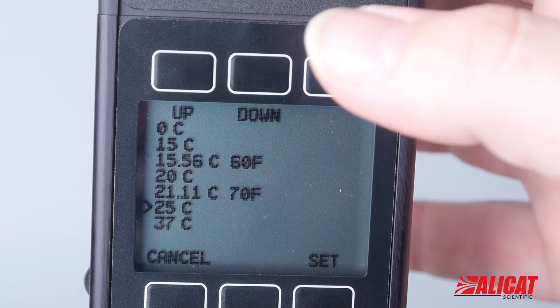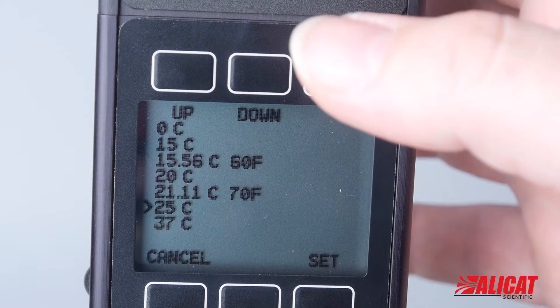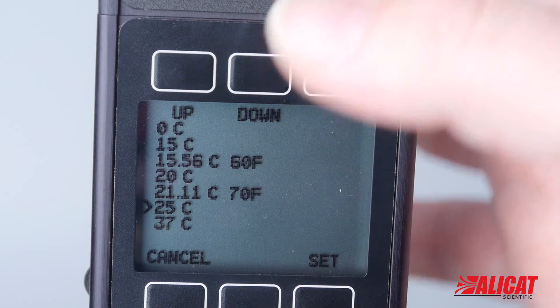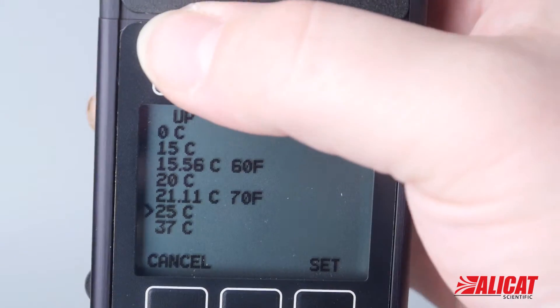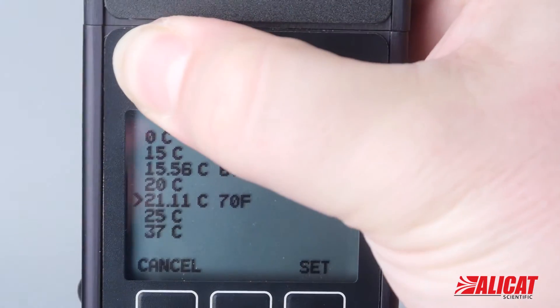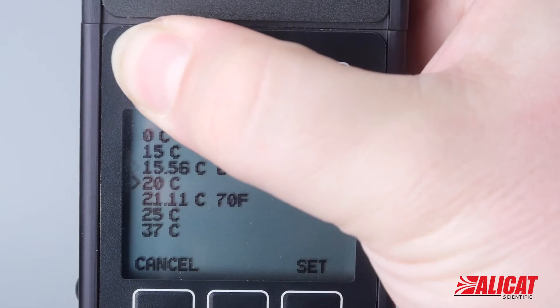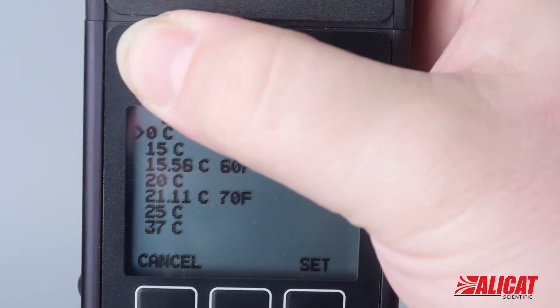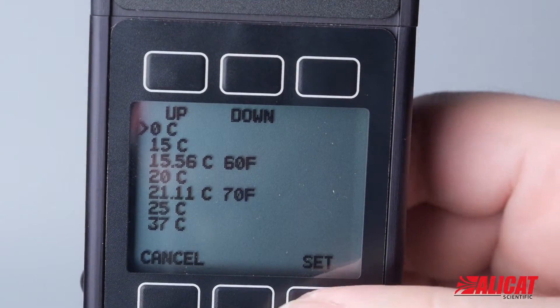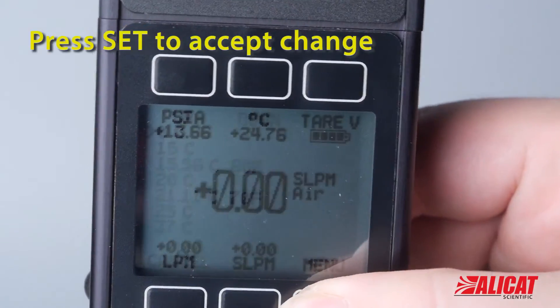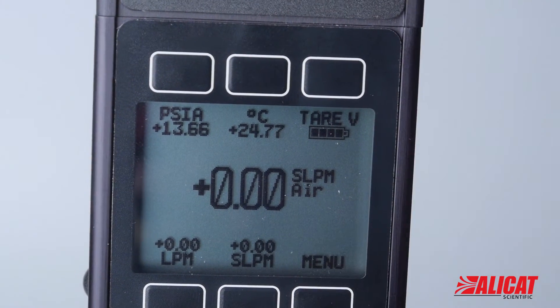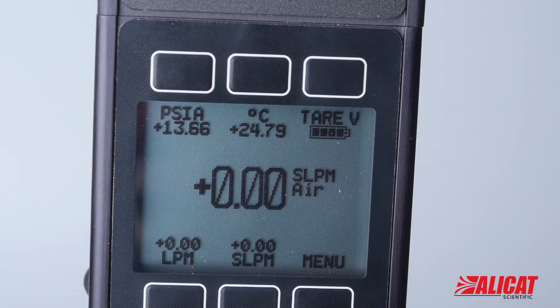The test we're doing is going to require a 0°C STP, so we're going to toggle up. Now the caret is next to 0°C. We can set that and we're at 0°C in one atmosphere, and we've gotten back to our main screen.